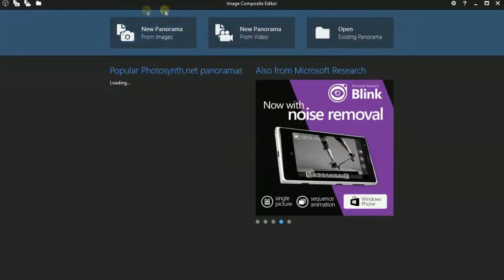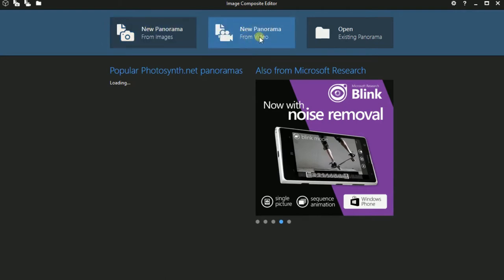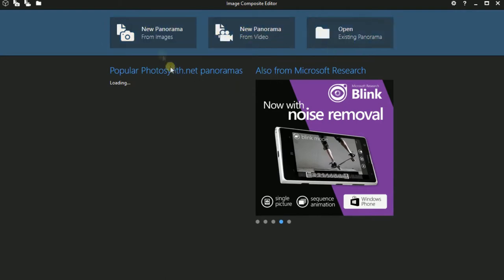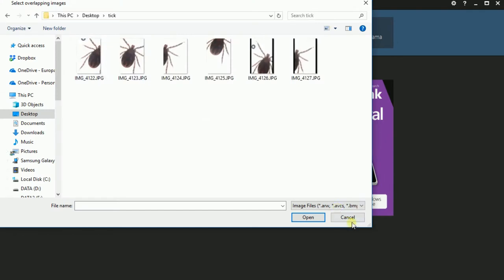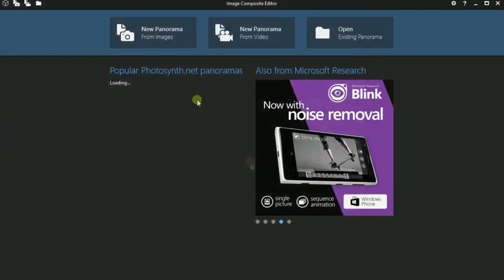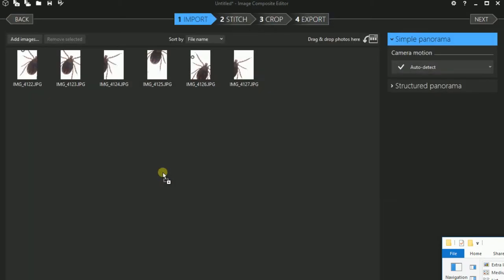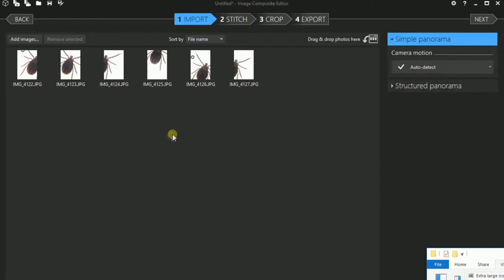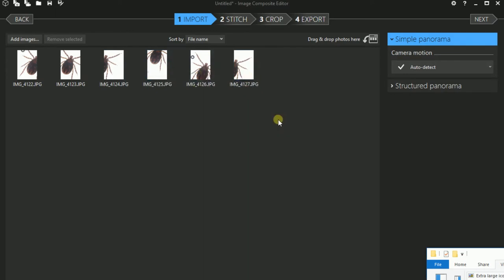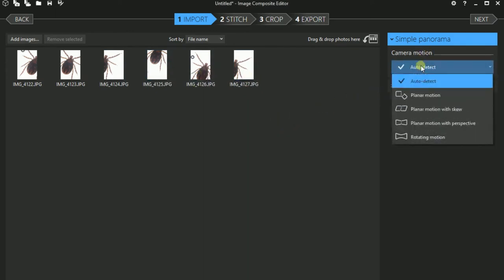After downloading and installing the program and starting it, you have several possibilities. You can either create a new panorama out of images, that's what I'm trying to do right now, or out of video which I'm going to show you later. You can directly open the images that you would like to stitch or you can drag and drop them just like I have done now. In this case we're going to stitch the images of the tick. There are six overlapping images that I want to combine together because the tick is too large to be taken a picture of right at once.